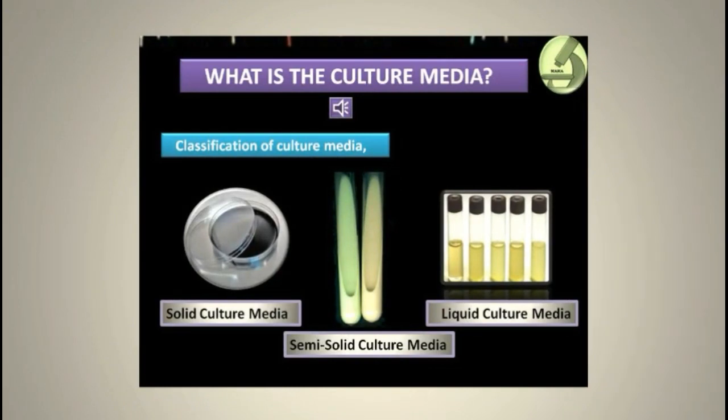A culture media is a special medium that supports different organisms to grow by providing different types of nutrients. There are many types of organisms that have their own specific requirement of nutrients to grow.